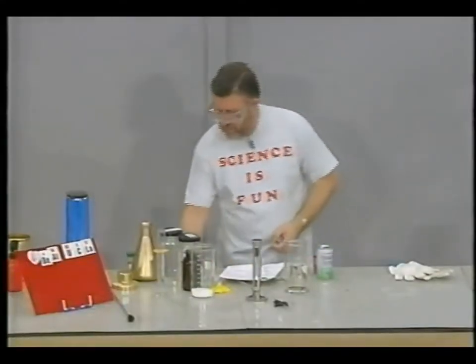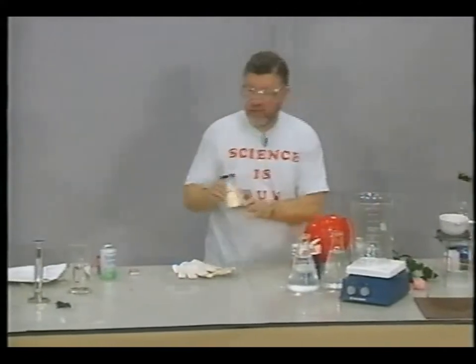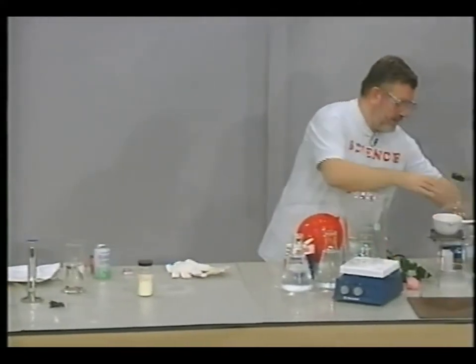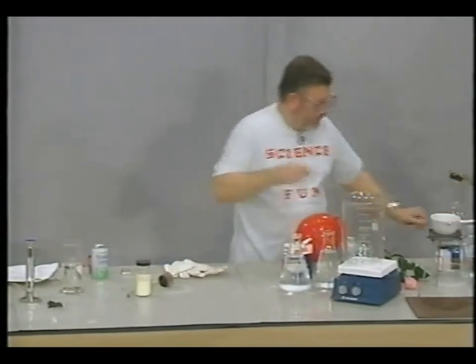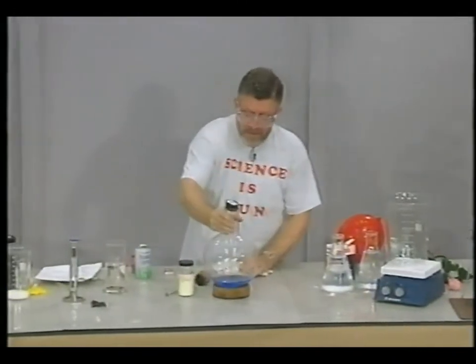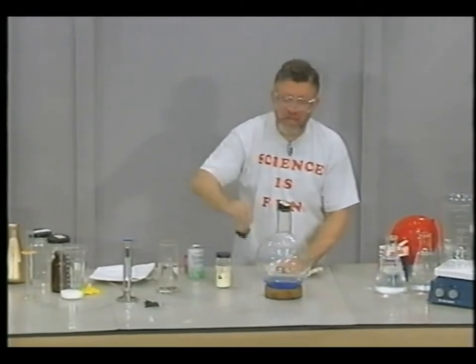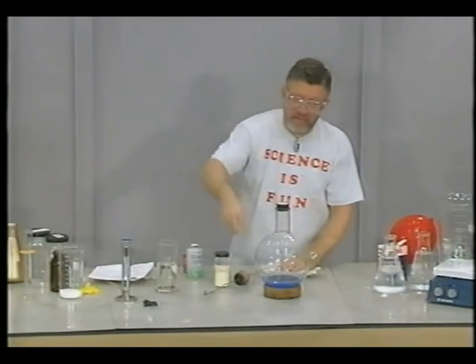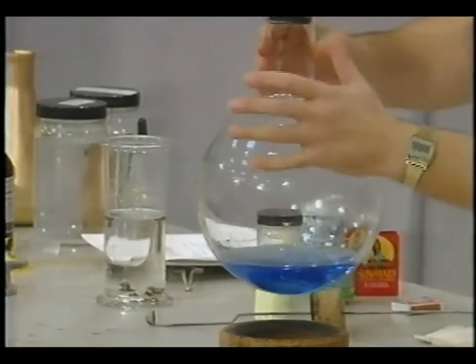And this experiment is one that we will do with an element called sulfur. This is the form that the element sulfur exists in. What I'm going to do is take some sulfur and burn it. After I start burning the sulfur that I will have in this spoon, I will take the spoon with the burning sulfur and put it inside this flask that's been filled with oxygen gas.